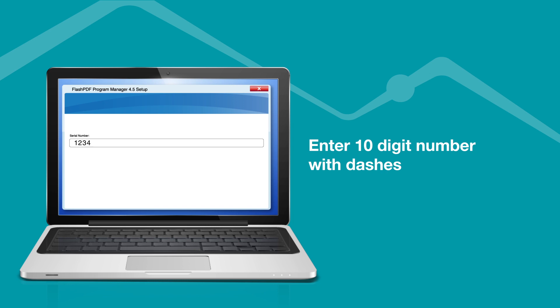Enter the 10-digit number including dashes, then continue to follow the setup instructions.